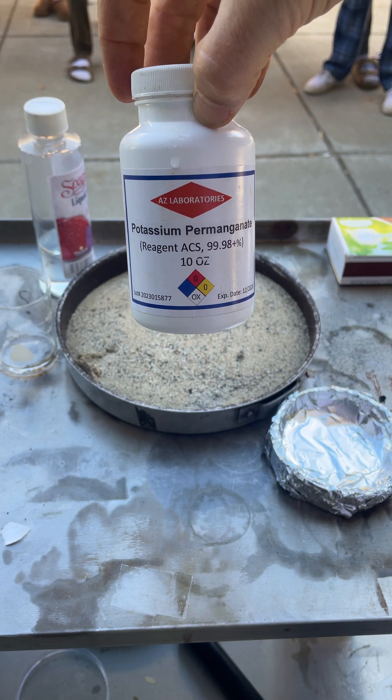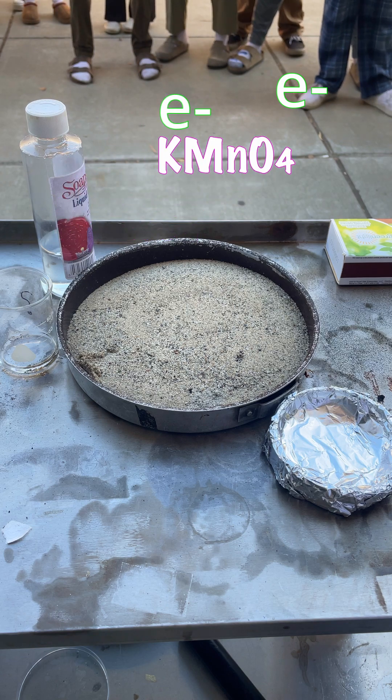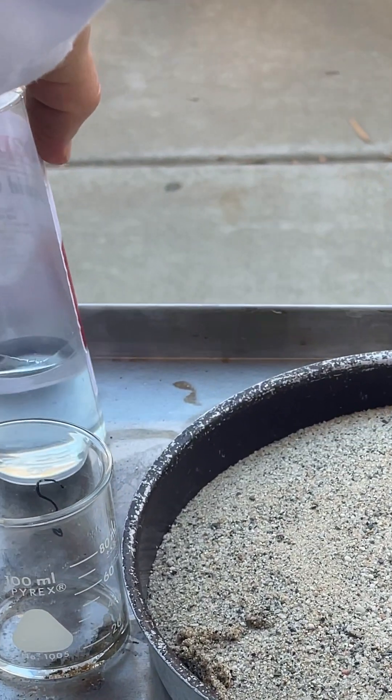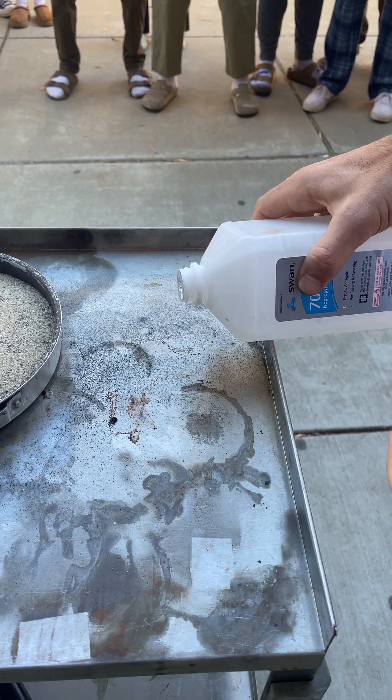This is potassium permanganate. Potassium permanganate really likes to take people's electrons, just like oxygen. This right here is liquid glycerin — it has some high energy electrons to be taken.